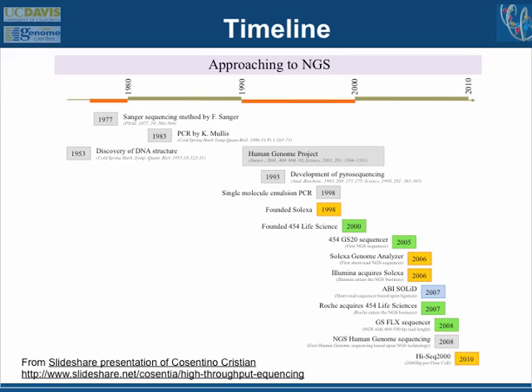And what I'm going to talk about when I go through the history is that the biggest transition was automation of the Sanger sequencing method with fluorescent DNA sequencing methods. And that sort of revolutionized genomics and sequencing and set the stage for a lot of the next generation sequencing methods. And then in the last few years, there's been this crazy progression of sequencing technology.